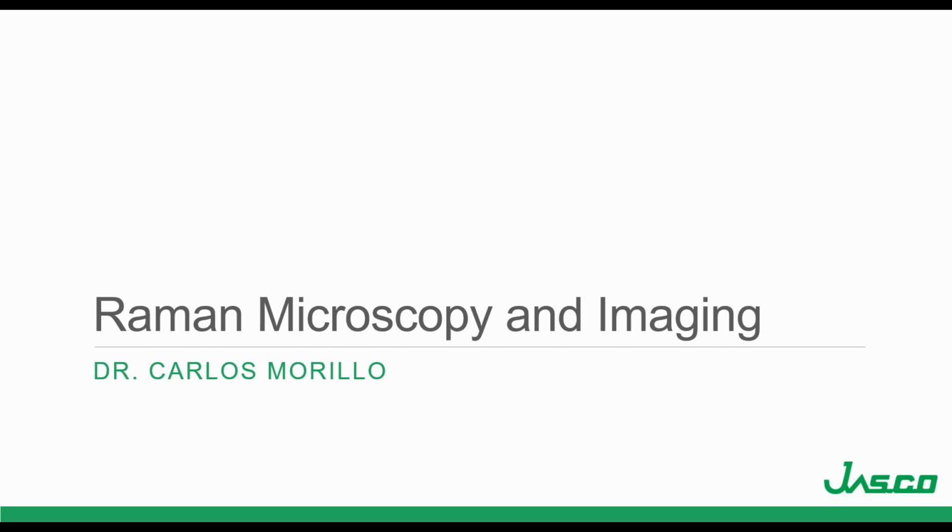Okay, thank you, Leah, for your introduction. Well, today I'm going to be talking about Raman microscopy and imaging.